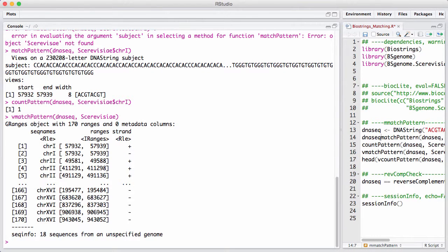First of all, there's hits on both the forward and the reverse strand. We didn't get that with matchPattern. matchPattern didn't search both the forward and the reverse strand of the object. We do that here.